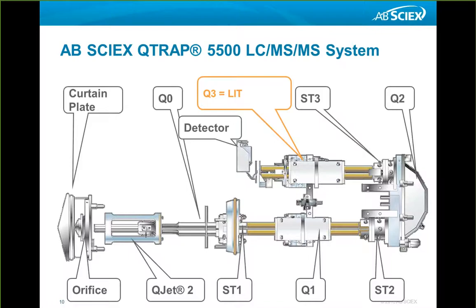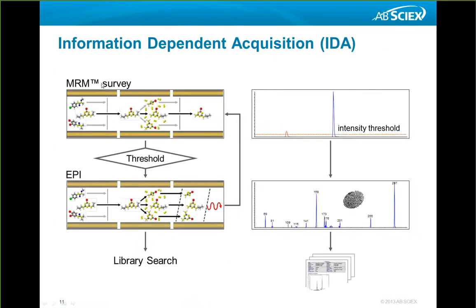The instrumentation that we are utilizing here, the QTRAP 5500 or QTRAP 4500 system with its nice linear ion trap capacity, allows us to even confirm the substances that we are doing in the quantitation mode. We also have capacity here for further identification aspects, and I would like to show you a few examples where we combine quantitative work with identification utilizing the QTRAP instrumentation.